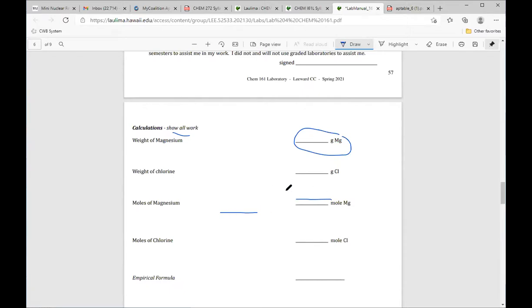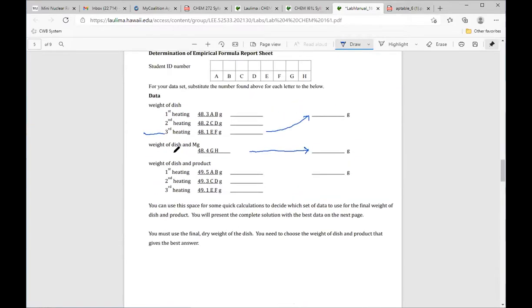All right, so those two are taken care of, right? Those are going to stay. Those don't change. And then you're going to heat the product, right? You're going to drive off, watch the video, you generate these numbers, and then for each of these numbers that you generate, you're going to use whichever one gives you the best ratio, whichever one gives you the best answer.